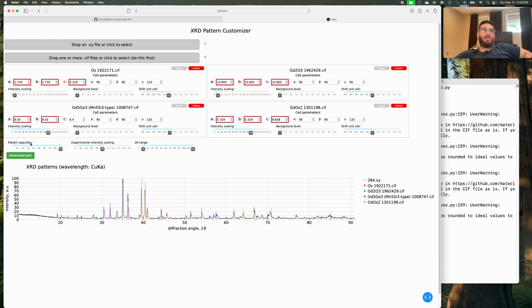And we've also introduced a new feature to lower the actual experimental intensity. So this sort of normalizes it, makes it less noisy while simultaneously lowering it depending on sort of interference and everything else. So you could fine tune it continuously. Very simple, lower, increase. Also change the cell parameters. This is more of a sort of advanced type thing. We just left it in case people see the need for it.